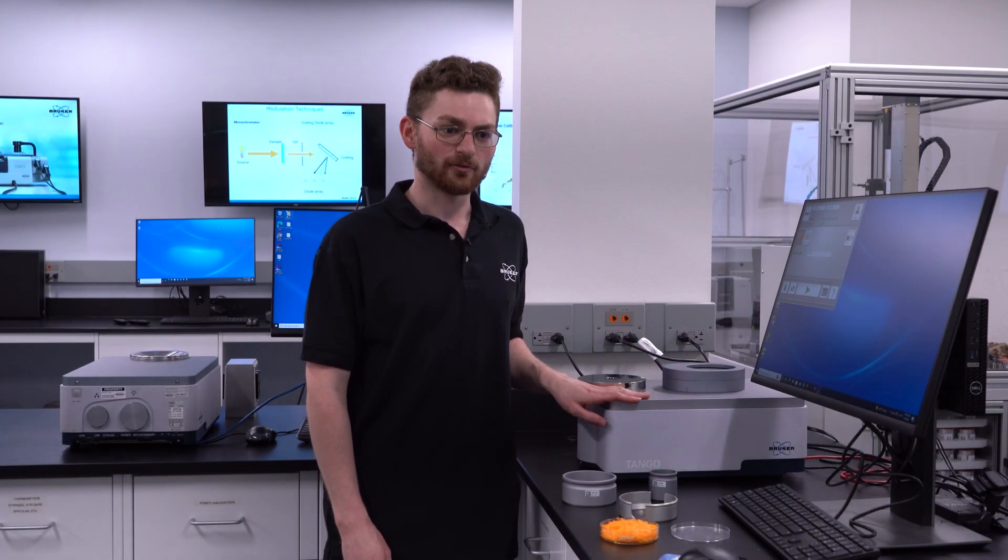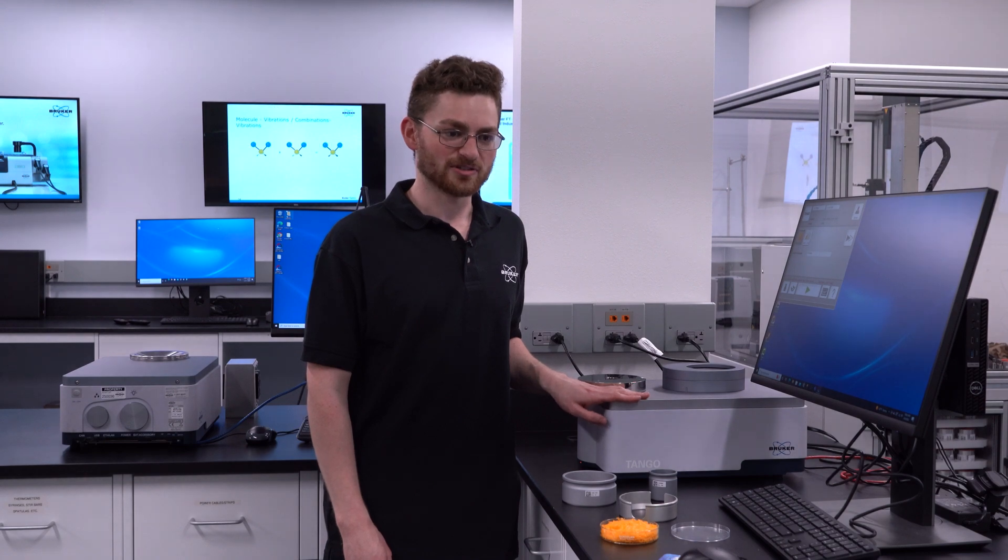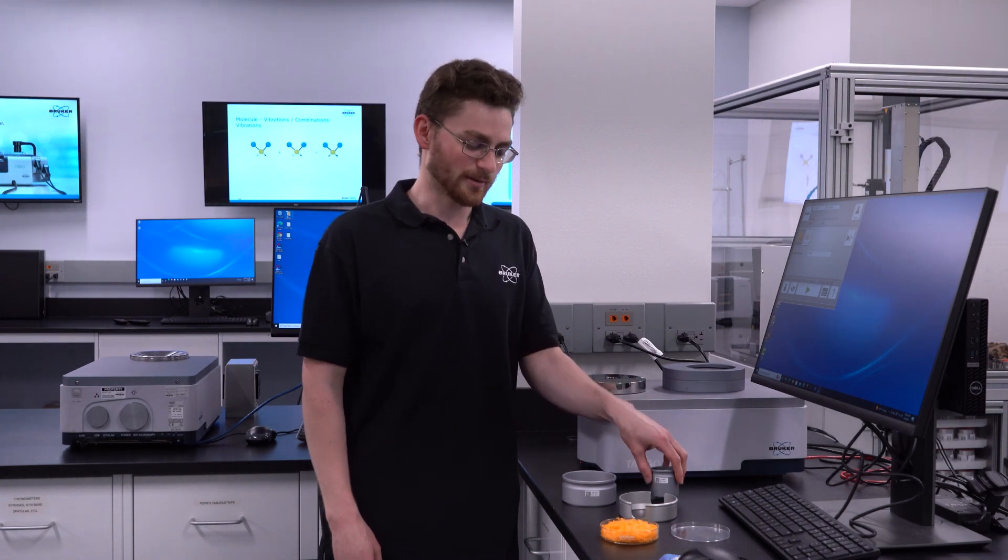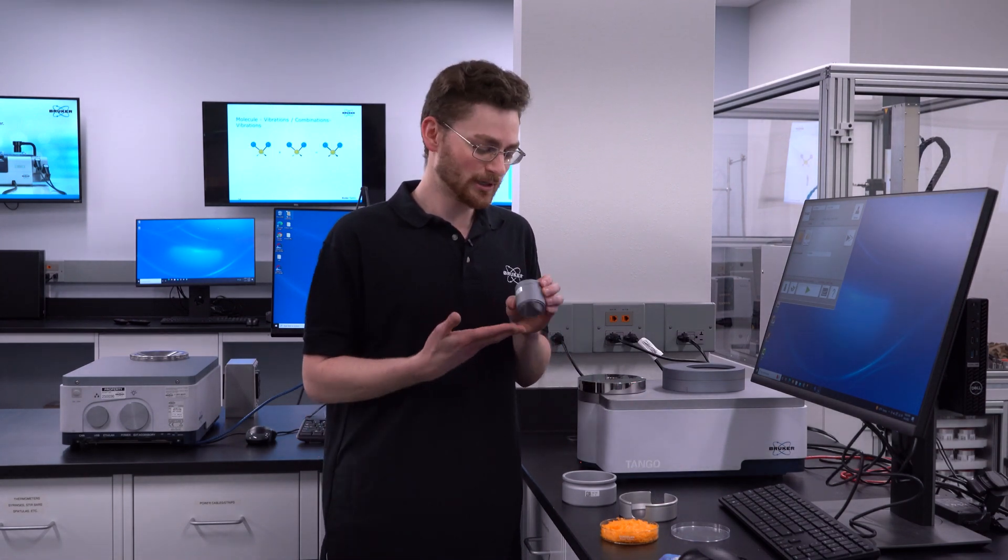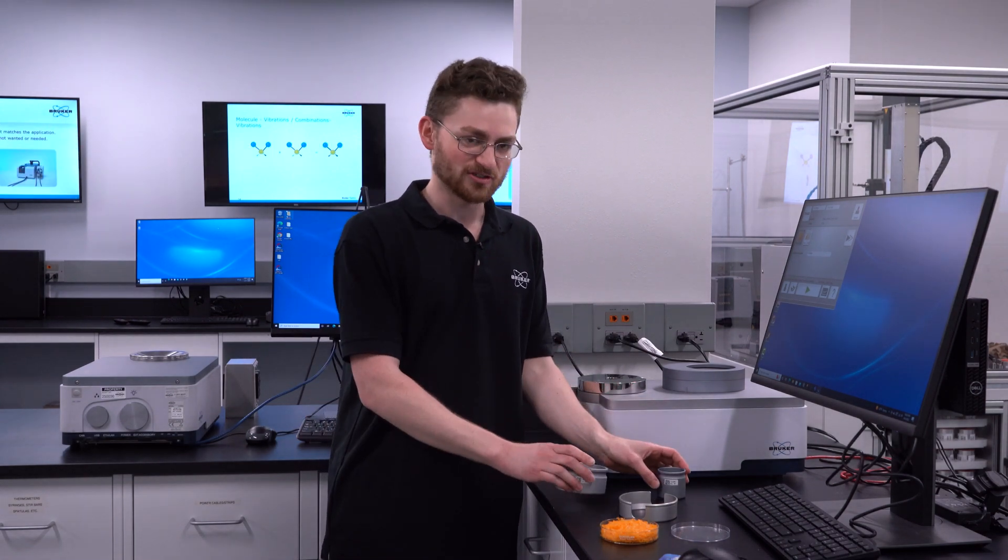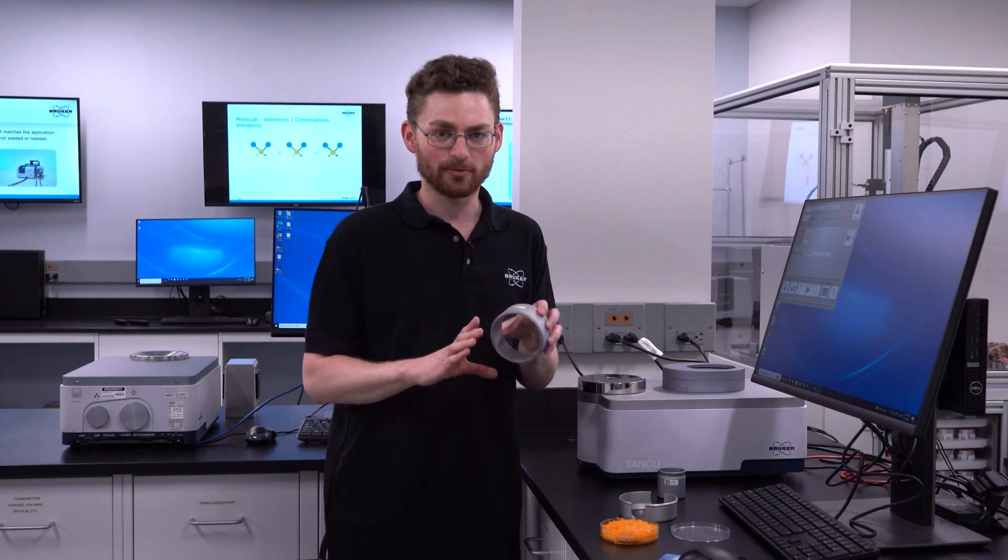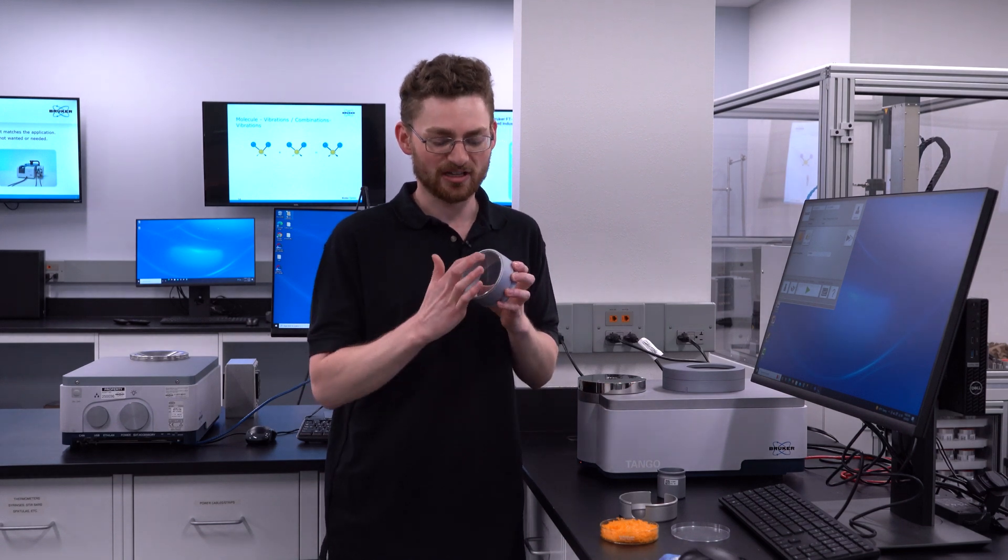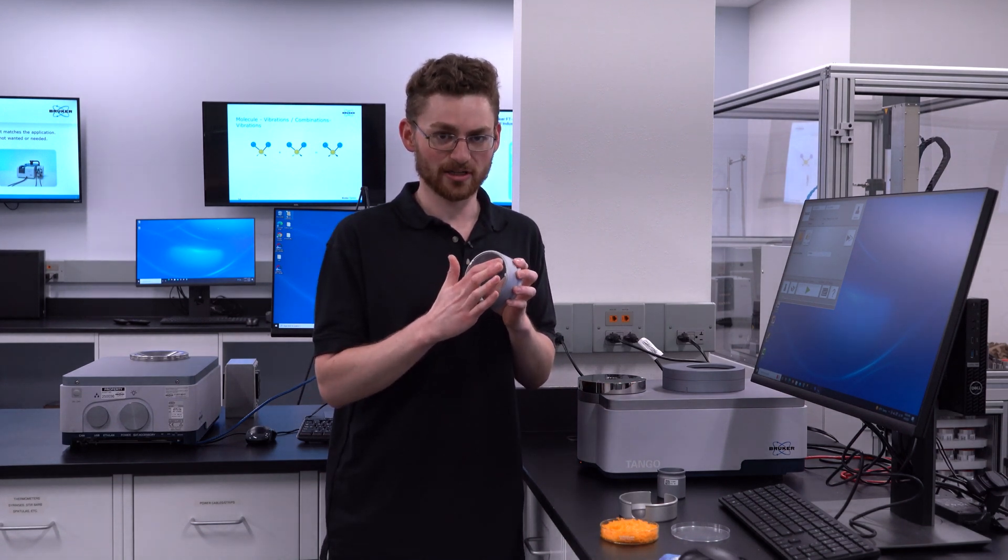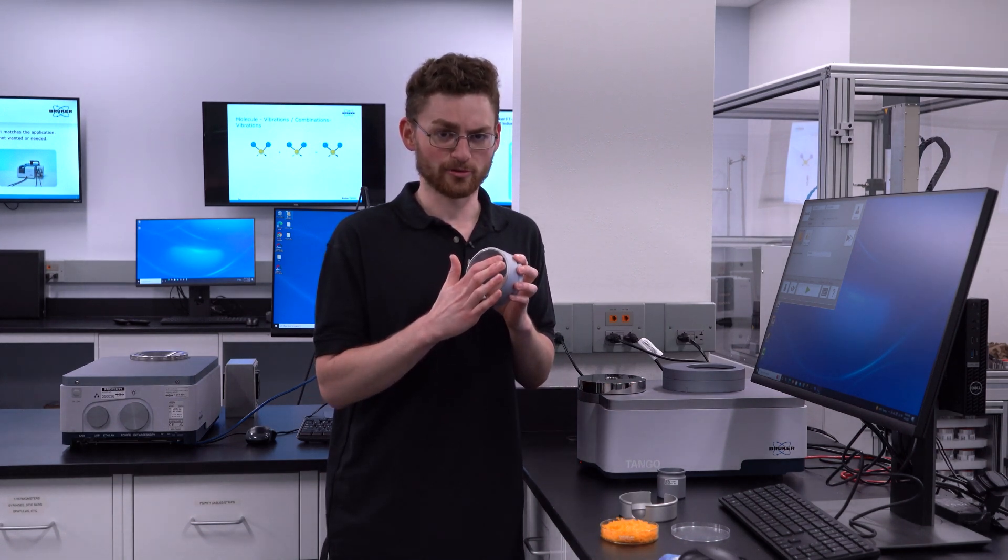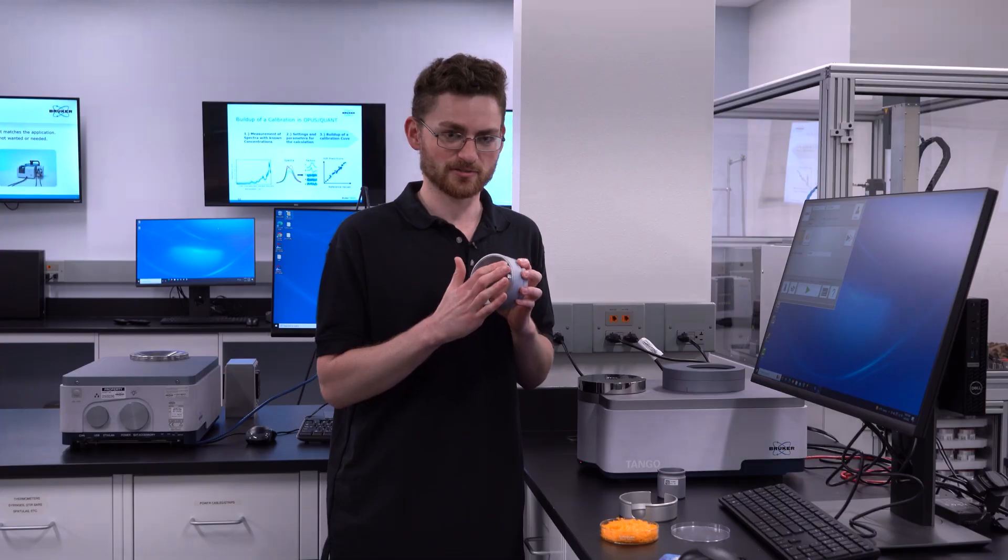The Tango has a variety of accessories available. It comes with a 51 millimeter cup, but we recommend using a 97 millimeter cup as it has a larger surface area presented to the light to give more reproducible measurements.